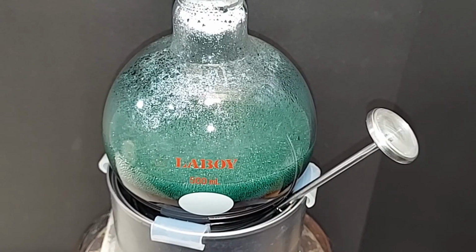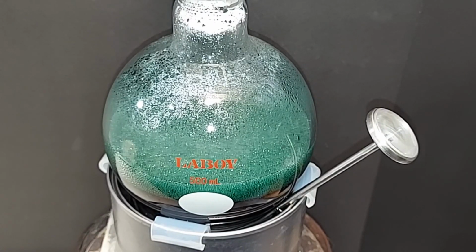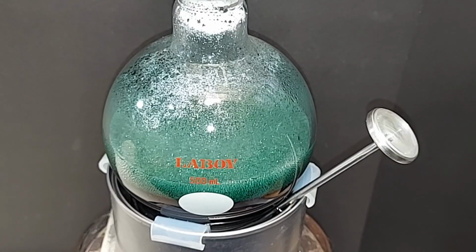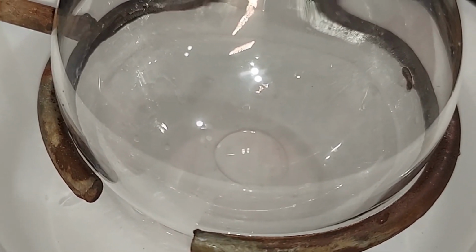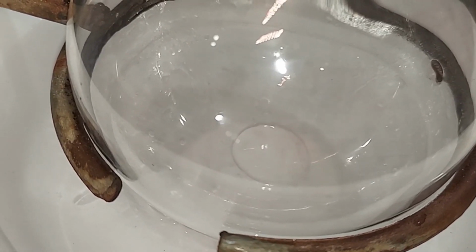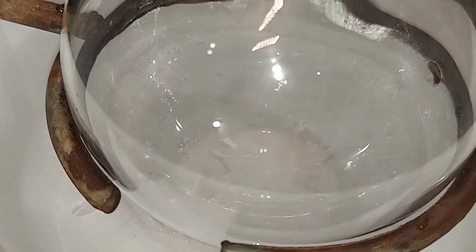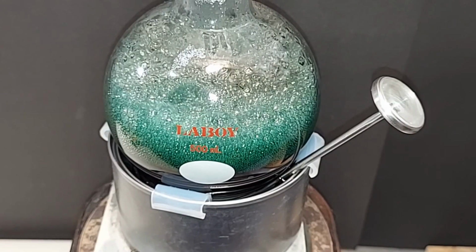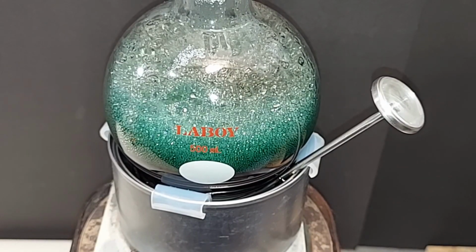There's a lot of boiling going on at this point, and I think it's just a matter of minutes now until we start to see our formaldehyde drip through on the other end, and I will show you when that happens. Well, I missed the first drop, but you can see it there on the bottom. That's actually 2 drops, and it's starting to come up, 3, 4. We're on our way. I didn't expect the foaming like it is, so got to watch it really close, make sure it doesn't get too high.